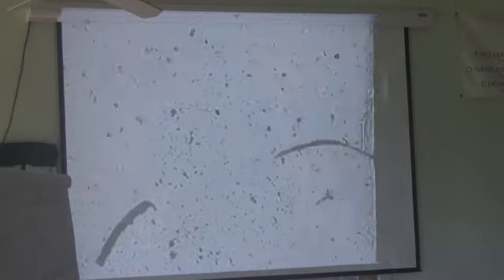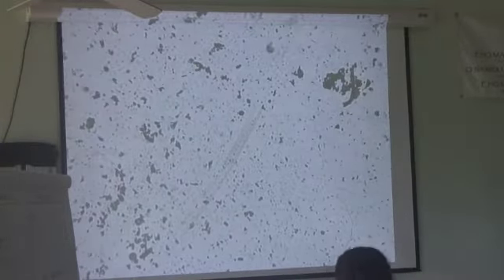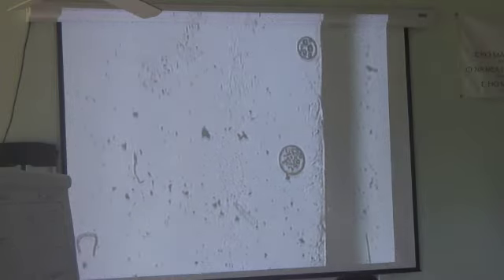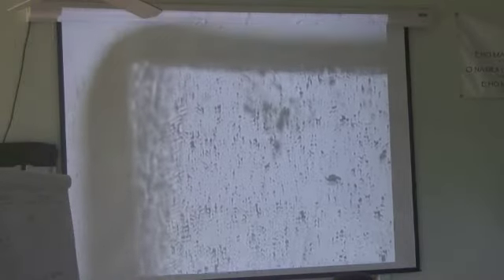And nematode populations are so much more variable that, you know, one sample has five or six, and then you'll get five or six samples with nothing in them. Sometimes nematodes cluster together. They do tend to cluster. Mom has babies, and they all hang around the same food source. Bubble, it could be, yeah, air bubbles, probably air bubbles. Come on. Let's see if we start talking to your critters.